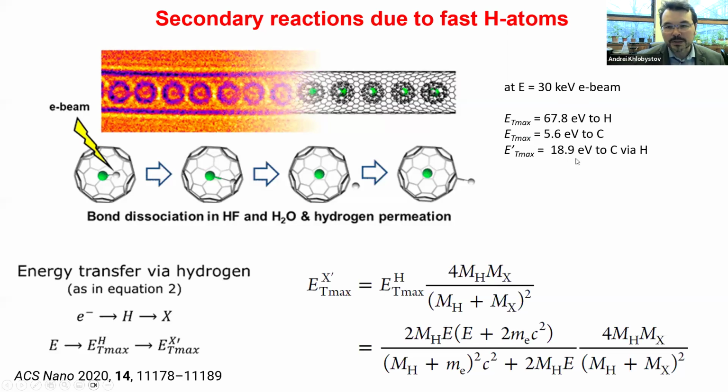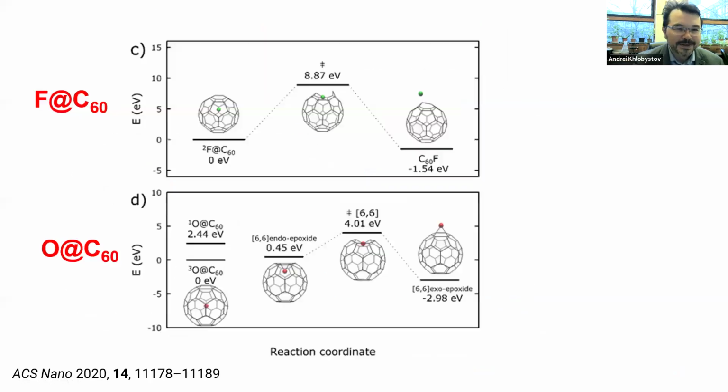So what that means is that we increase significantly the amount transferred by hydrogen, and this is of course bad news for the carbon atoms of the fullerene, and that's what causes their break up under these conditions. Again, hydrogen is really challenging in TEM, and if possible, we should not really look at molecules containing hydrogen at the single molecule level, because it complicates everything.